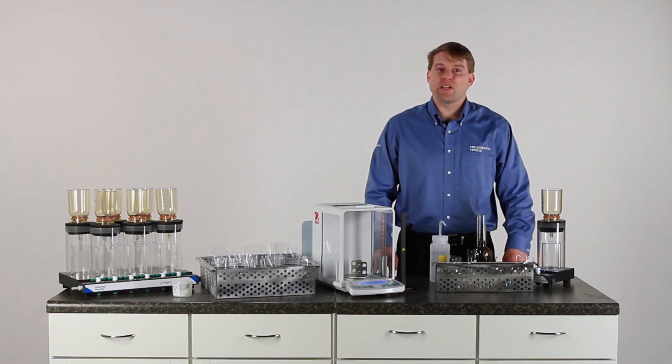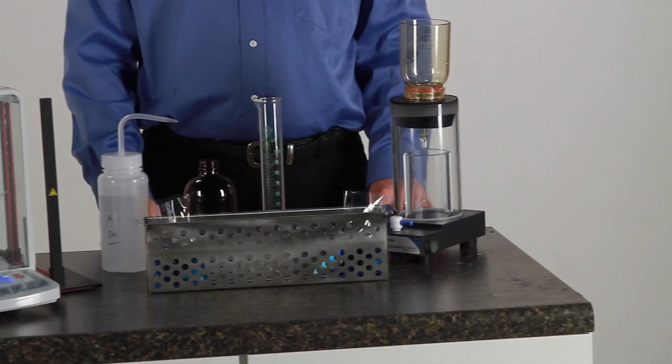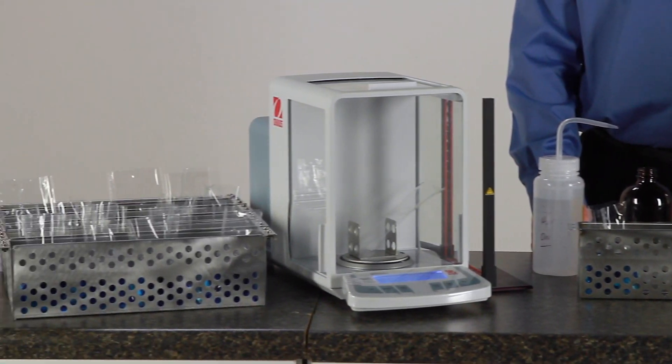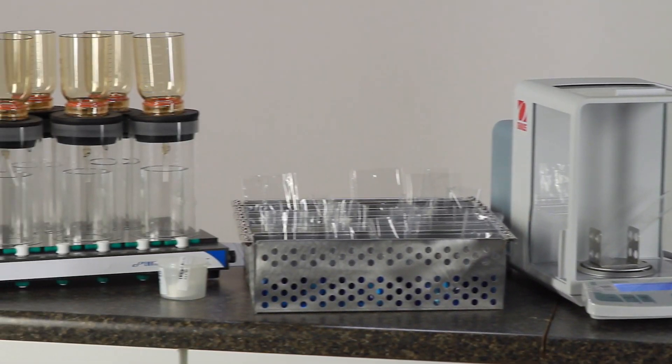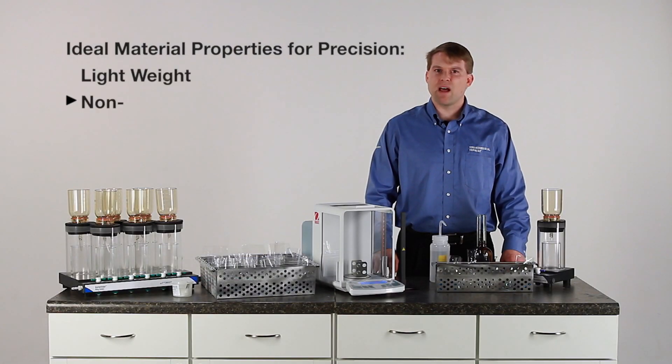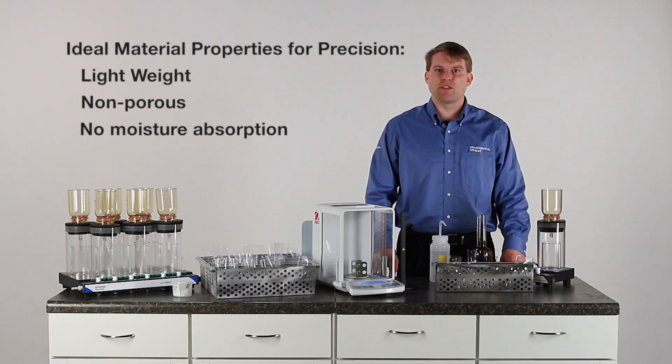The method requirements for the preparation of your TDS vessels can be quite tedious. Having to clean and dry and weigh the vessels can lead to some inaccuracies in your data collection. Additionally, the material of the vessel can be quite important to take into consideration, as a lightweight non-porous material that does not absorb moisture will lead to more precise measurements in your data results.